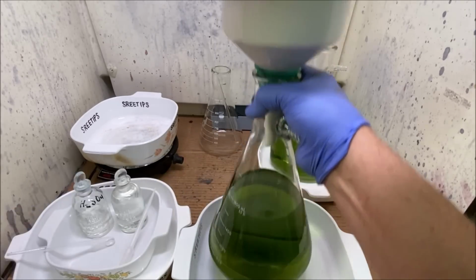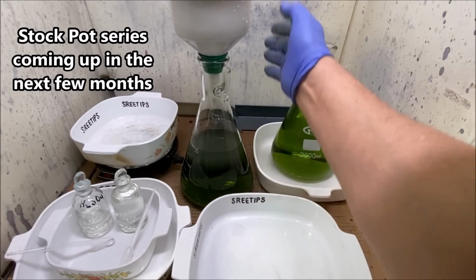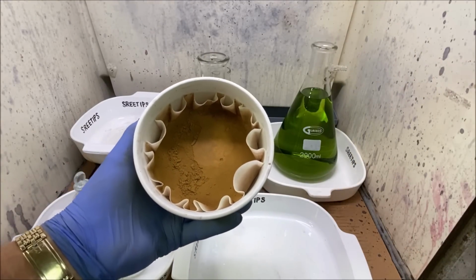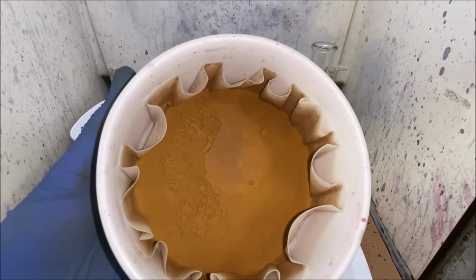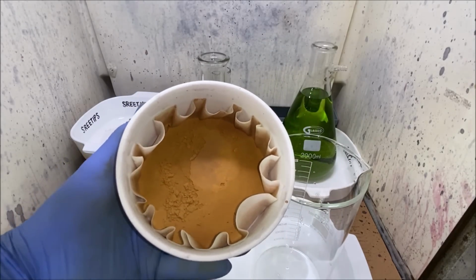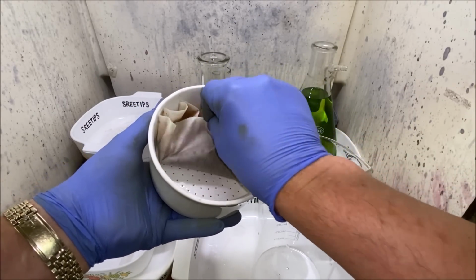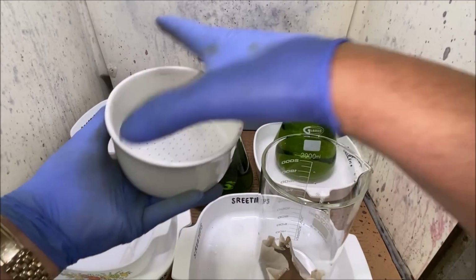in our filter here. Again, this is a waste solution with platinum in it. We're going to add that to the stock pot. It's not enough to try to refine and recover. Here's our gold. Looks pretty good. And I've seen it look like this. It's a very fine, like talcum powder. And the volume looks scrawny. But it turns out to be quite a bit of gold in there, more than you think. So I'm going to put it in this beaker now.